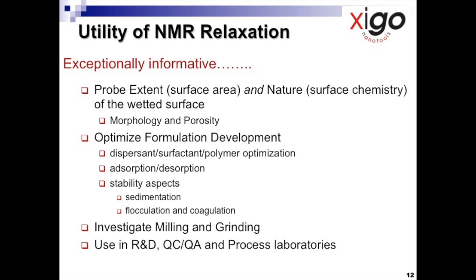At a practical level, NMR relaxation measurements will find use from blue sky exploratory research and development through quality control, quality assurance to process monitoring in almost any industry.